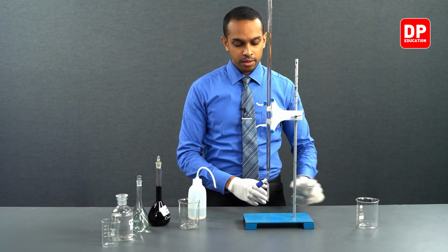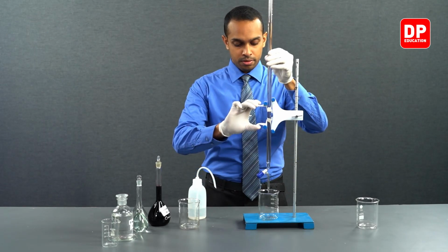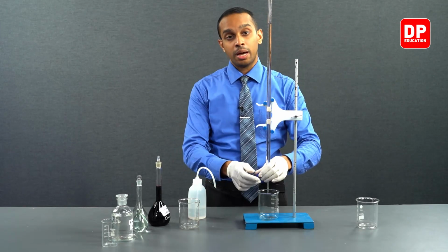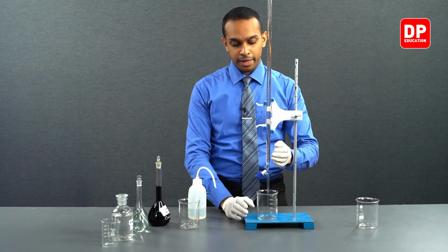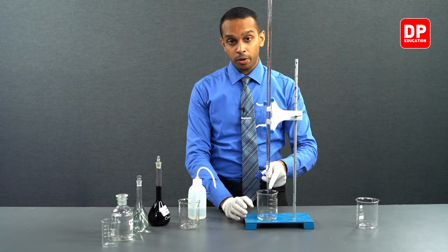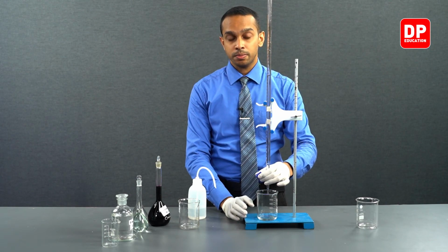You will take a beaker and open this tap rapidly, making sure the tip of the burette is also cleaned with distilled water.